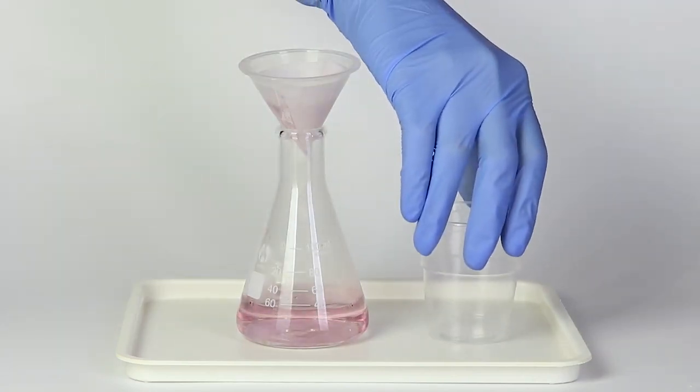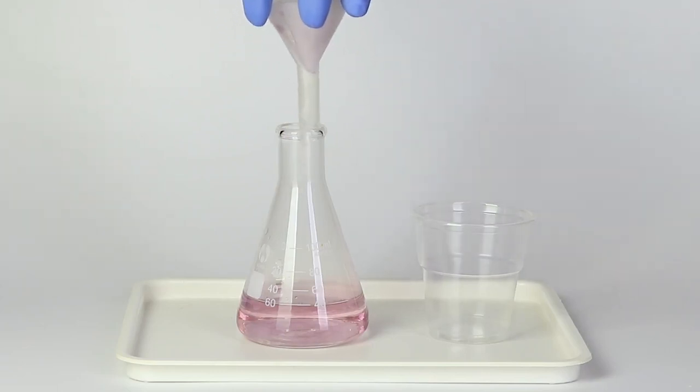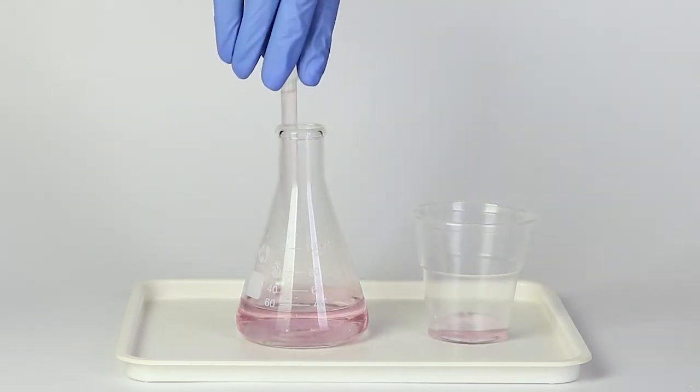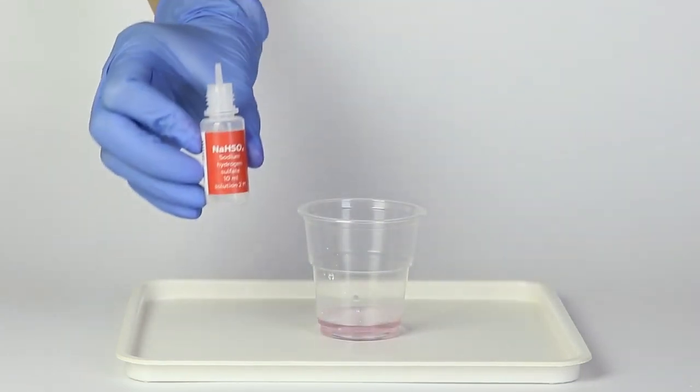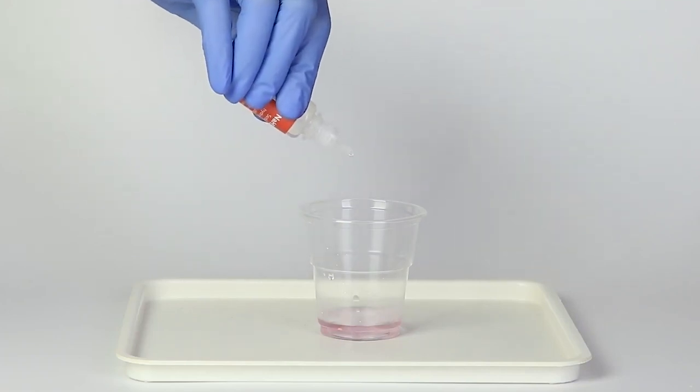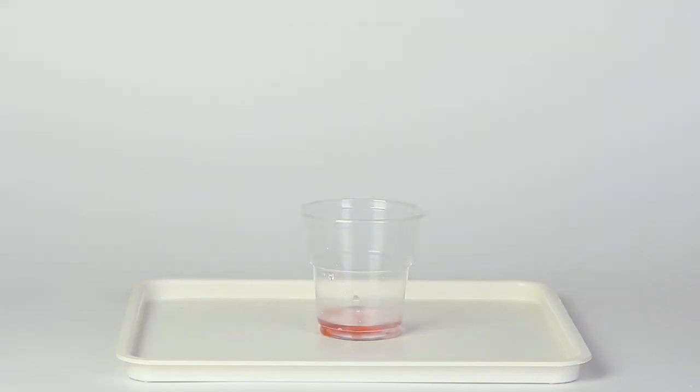Take one more disposable cup and pour some filtered solution into it using a pipette. Then add three drops of sodium hydrogen sulfate solution. The solution will change colors from pink to red.